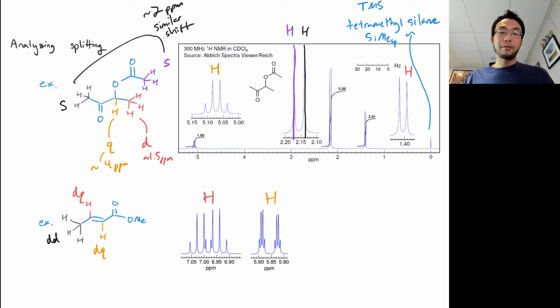That was a lot of information about splitting in NMR spectroscopy. Hopefully what we can take away from this video is the ability to take a given molecule and predict what its splitting patterns and signals will look like. And the next step would be to take a spectrum and use its splitting pattern to help refine the actual structure of a molecule.